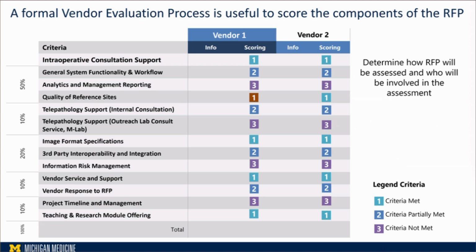This is a sample we shared with you right now of literally hundreds of questions that we had, from technical and clinical. But I tried to share with you: we put some weighing criteria, criteria met, criteria partially met, criteria not met, and then we put a weighing criteria about the importance of the criteria that we need, and multiple vendors that you can rank them. After the rank, you can find the upper vendor and the lower according to their rank.